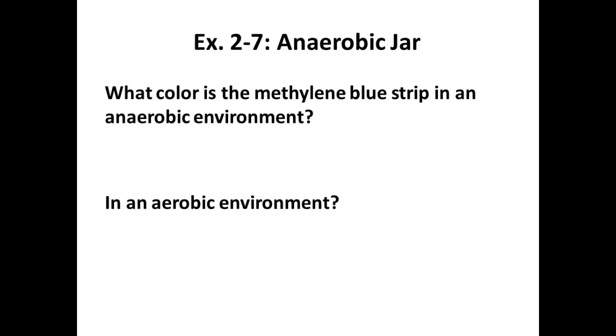Okay. So anaerobic jar, again, we're trying to create an anaerobic environment. So we have to have some way to indicate when we have that anaerobic environment, when there isn't any oxygen, but we can't see gases with our eyes, right? So we need some type of indicator. The indicator that we use for this test is different than the resazurin. We use methylene blue. Typically it's in a strip or in a tablet.